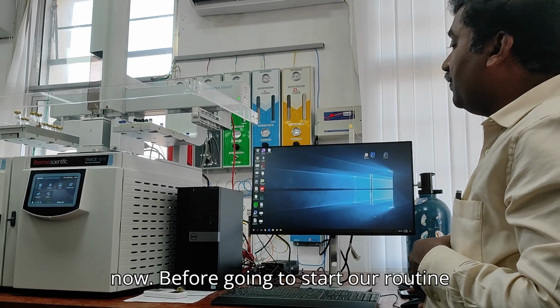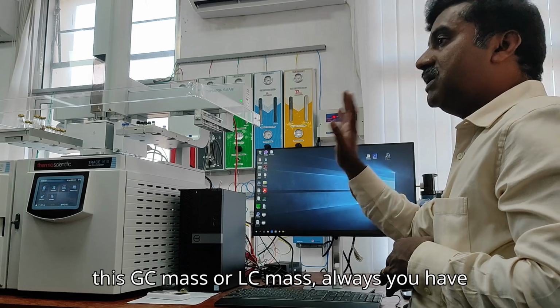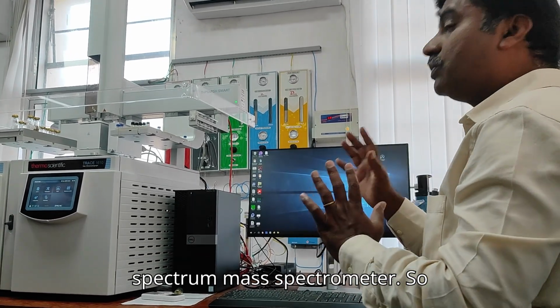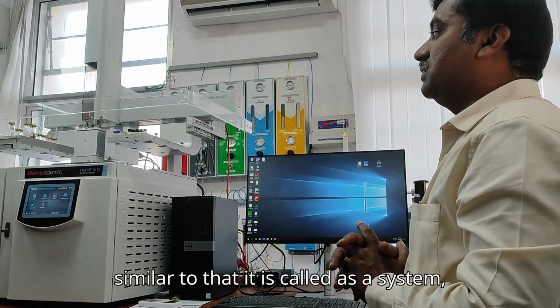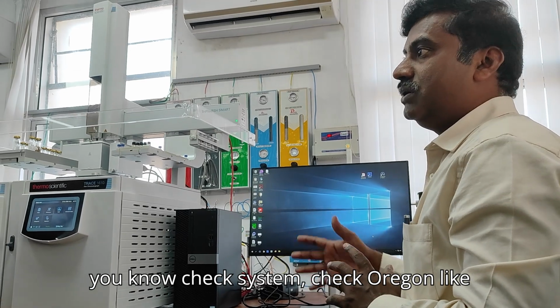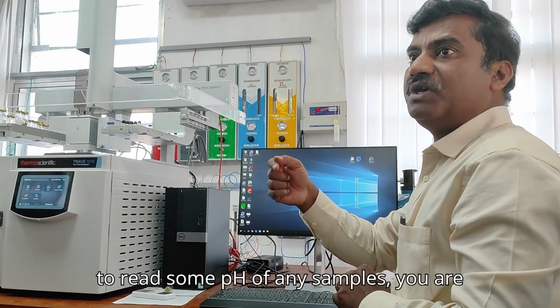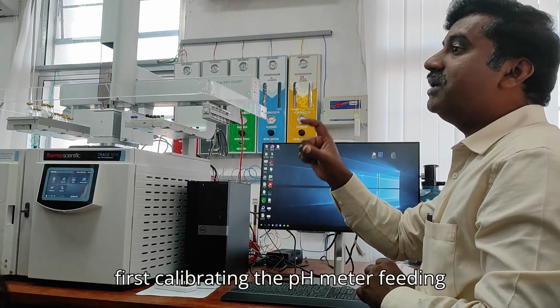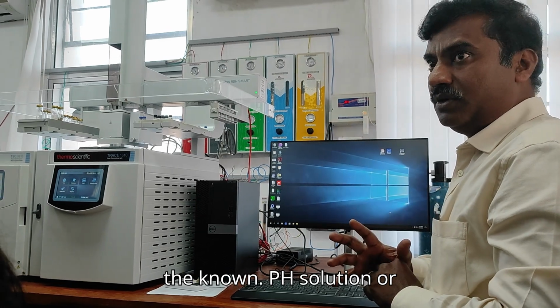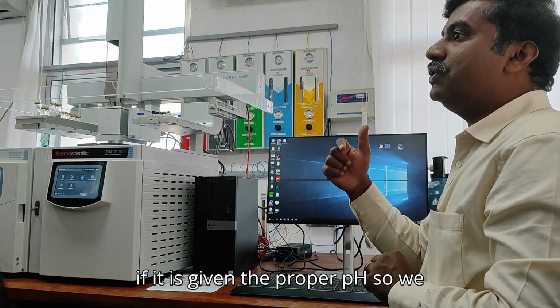Now before starting our routine analysis, whenever you are working on this GCMS or LCMS, you always have to monitor the status of the mass spectrometer. It is called a system check, similar to your normal pH meter. Whenever you want to read the pH of any sample, you first calibrate the pH meter, feeding the known pH solution, or pH buffer solution. Then if it gives the proper pH, we directly take it.